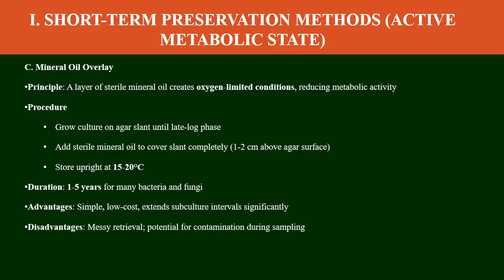The duration of mineral oil overlay is 1 to 5 years for many bacteria and fungi. It is very simple and low cost, which extends the subculture intervals significantly. The disadvantages of mineral oil overlay are messy retrieval and a potential for contamination during sampling.